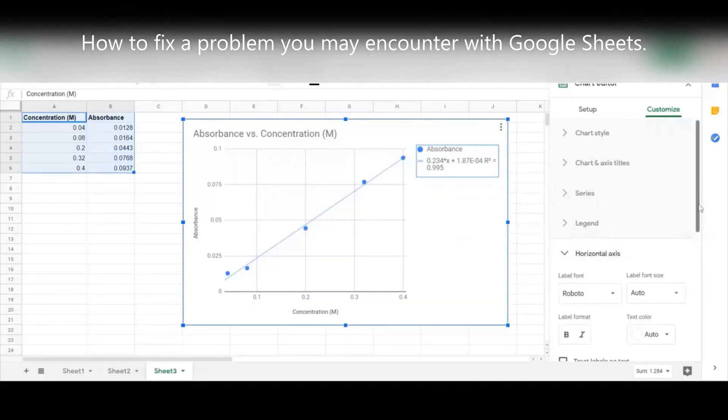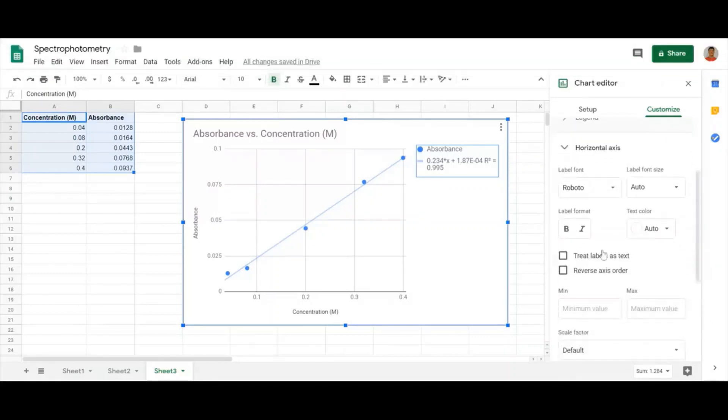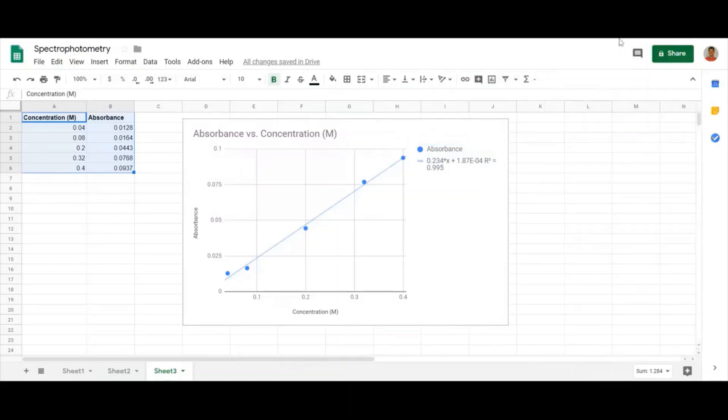If you are using Google Sheets to analyze your data, you may run into an issue with getting the wrong equation for your line. Check the chart editor under customize, horizontal axis, the box called treat labels as text. You can see by checking this on and off, I'm able to change between the correct and the incorrect version of the equations for this line. One way of knowing that your linear regression analysis was incorrect would be to compare your calculated results with the visual comparisons you made earlier in the experiment. If they don't match up, it could be because your linear regression was done using the incorrect version on Google Sheets.